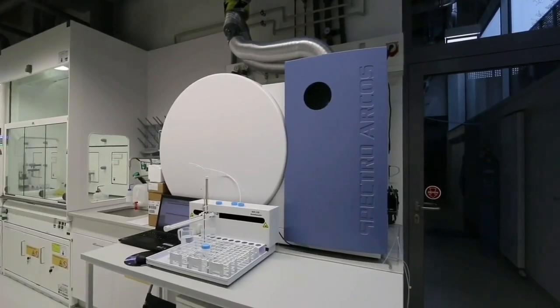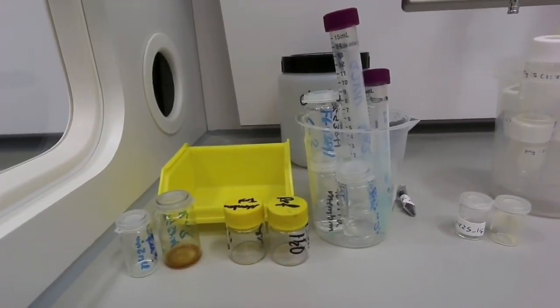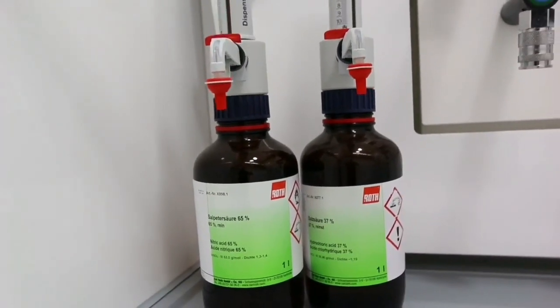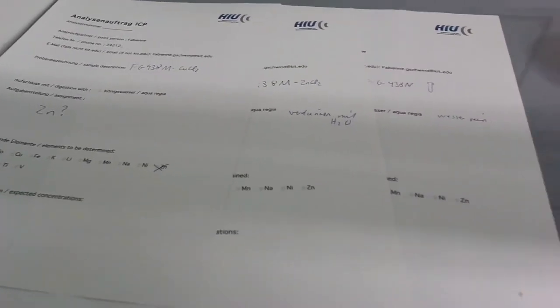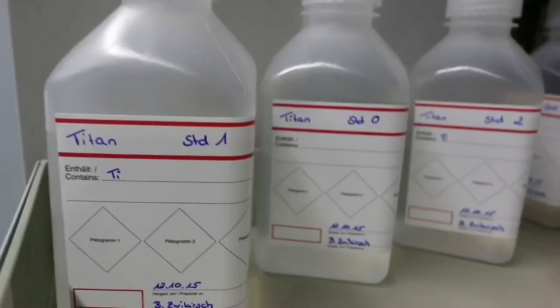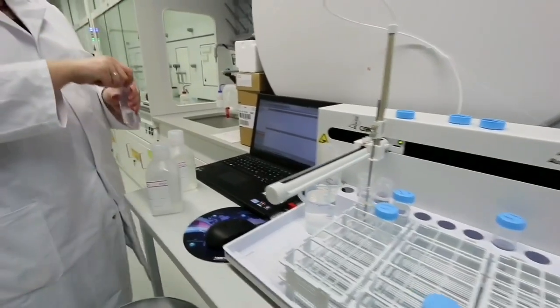After that, before using the ICP-OES machine, the sample should be prepared. Then, for each element that we want to measure, a standard needs to be purchased, and standard solutions of different concentrations need to be prepared. After that, the sample can be poured into a test tube.